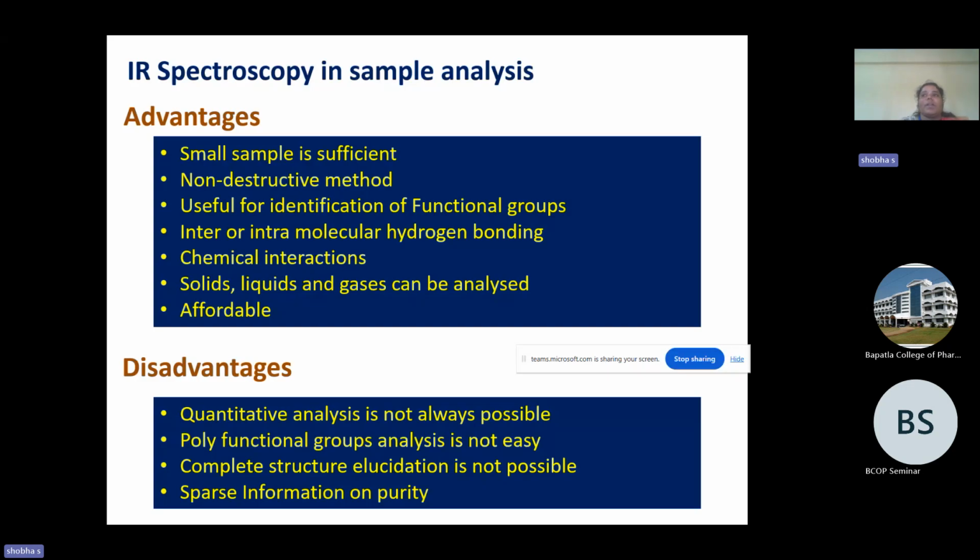If we want to formulate anything, or react something, suppose we are going to take the alcohol and acid. By combining these, we expect the ester. The ester group will give significant peaks in the region of zone 4 and zone 2. Likewise, we may go for the analysis of individual peaks. From that also, we can tell whether the interactions have taken place or not.